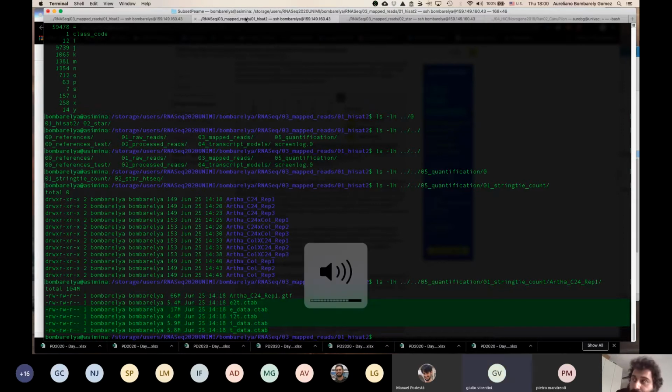I have a question. Not really in this part, but anyway. When we do a paired-end analysis, we get 2 files for each sample, right? So the moment when we merge these 2 files is when we input them in STAR or HISAT2. Is it correct? Yes, when you are mapping. Okay, thanks. Just because we did a lot of stuff today.